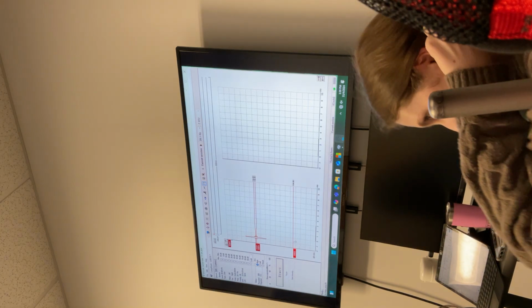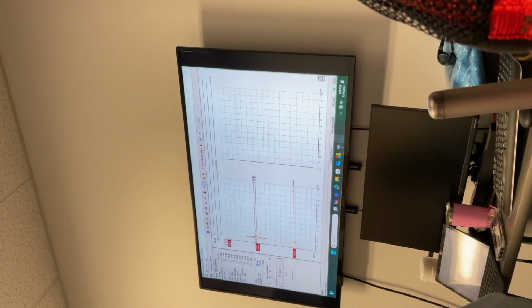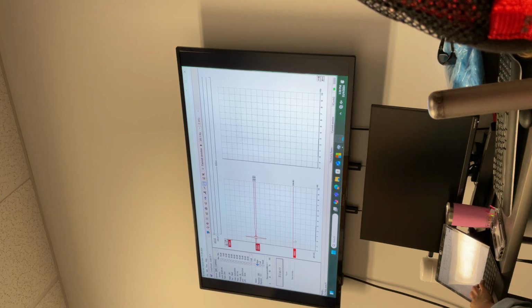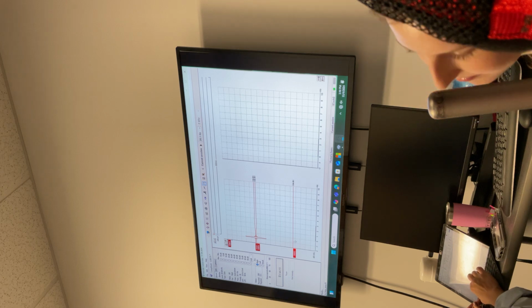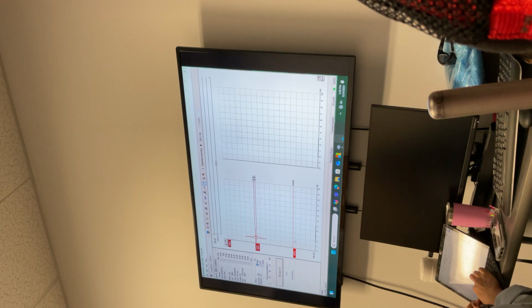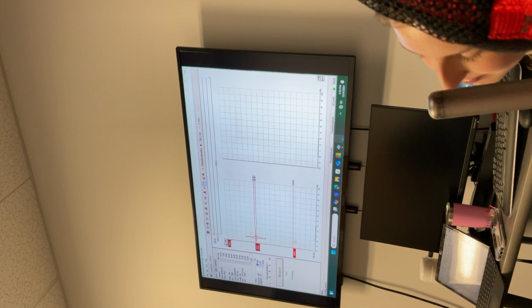Yes. Imagine there is some problem. You are not seeing the correct responses. What if, to figure out whether it's a problem with the transducer or the system itself. If the loopback is working well, then if it's not coming through the transducer, then it's a problem with the transducer. So this loopback wire is directly connected to the port with the transducer.